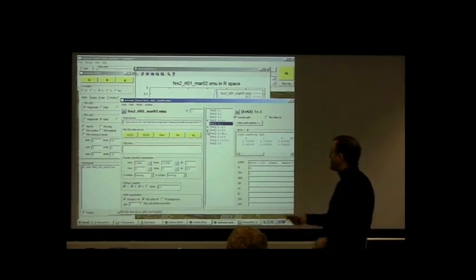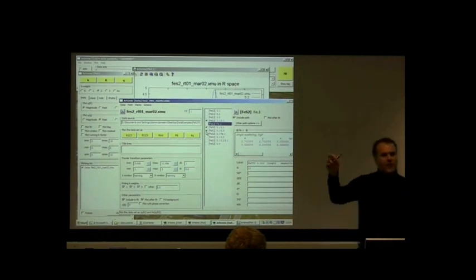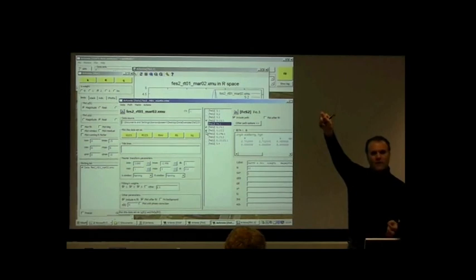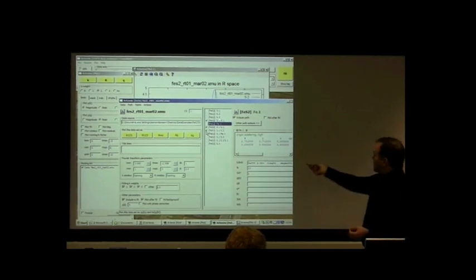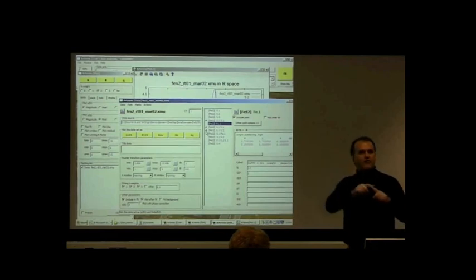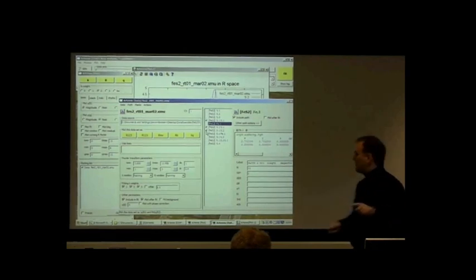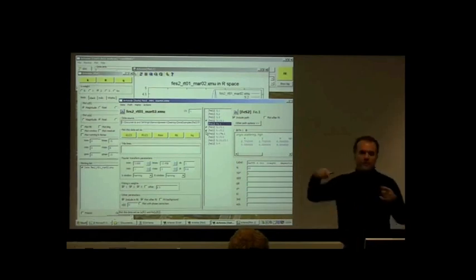This one down here is a scattering path that scatters first off of a sulfur atom in the first coordination shell, then off of a sulfur atom in the second coordination shell, and closes the loop. So this one, this one, this one, and those two are all double scattering paths that make some kind of triangle in the material. This last one down here is a triple scattering path that makes some other shape, something that bounces three times.